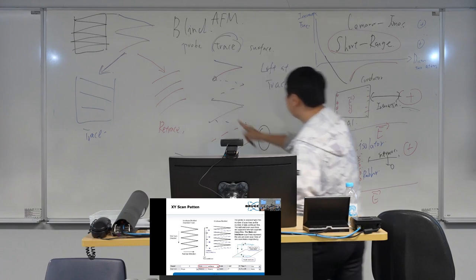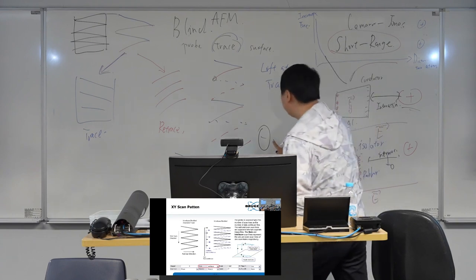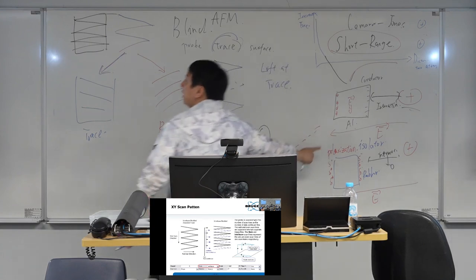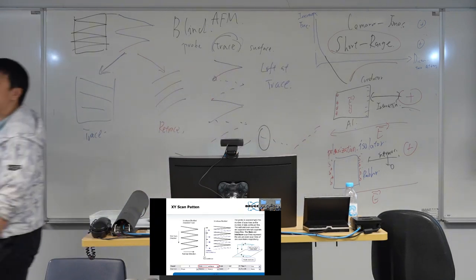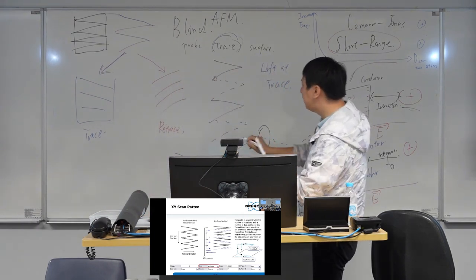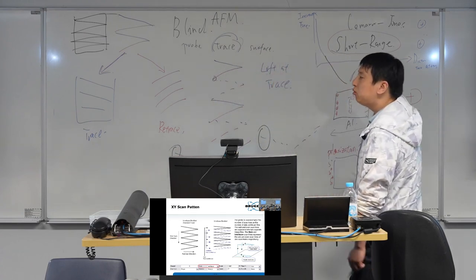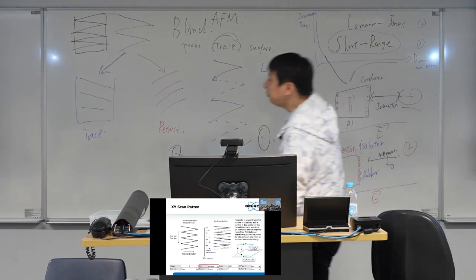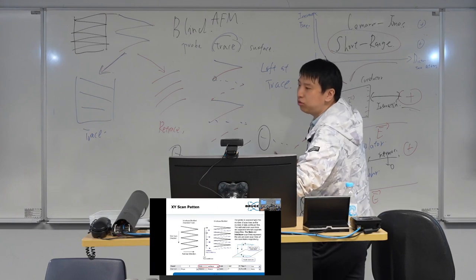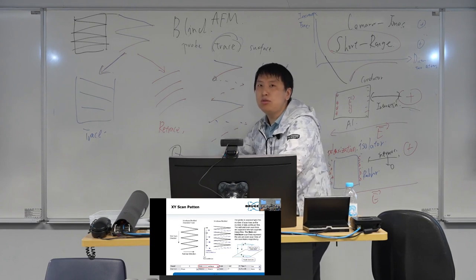So this lift motion will take place at the beginning of the interleave trace. And then interleave trace, interleave retrace, and then what? The probe should go back on the surface, it will drop down. And this drop down will happen on what? On the beginning of the main trace. So in our setup, the lift is on the beginning of the interleave trace, and the drop is on the beginning of the main trace.